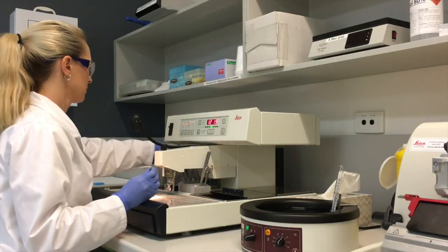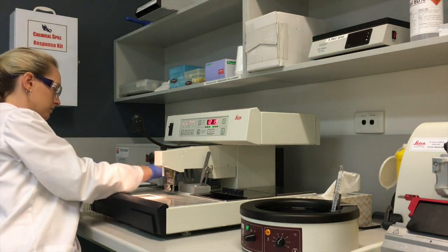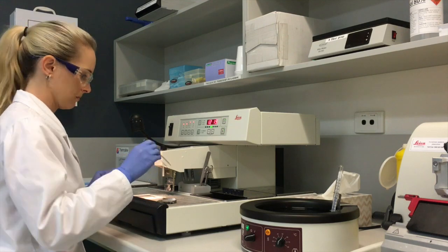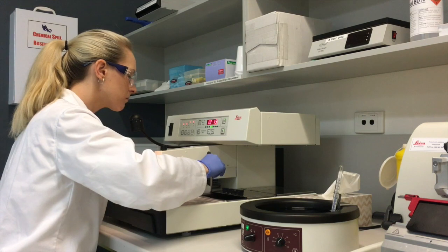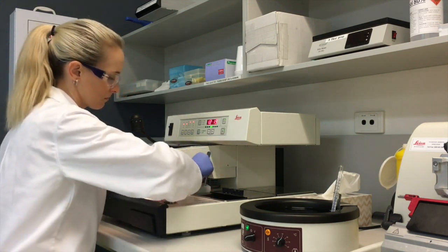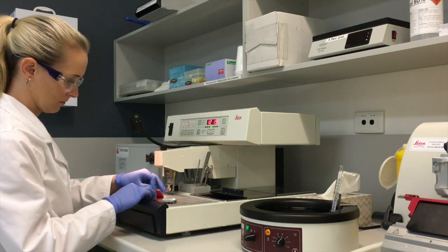The embedding center consists of a hot and cold surface. The high temperature keeps the paraffin wax as a liquid so that it is easier to manipulate the tissue sample from the cassette to the mold. At the embedding center, the tissue sample is removed from the cassette and is placed into a mold.